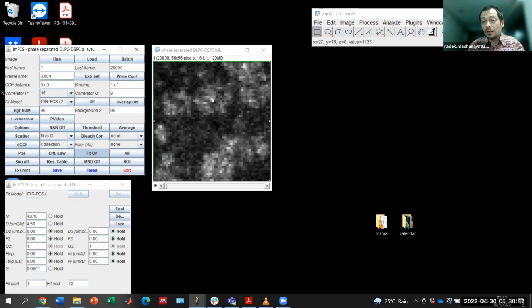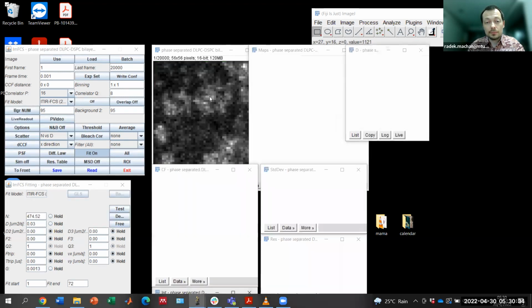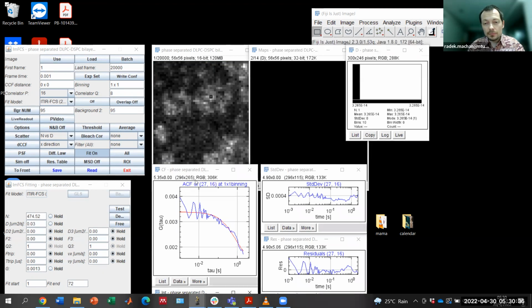So in the ordered and disordered phase, we should see differences in diffusion. So let's try. We click here.